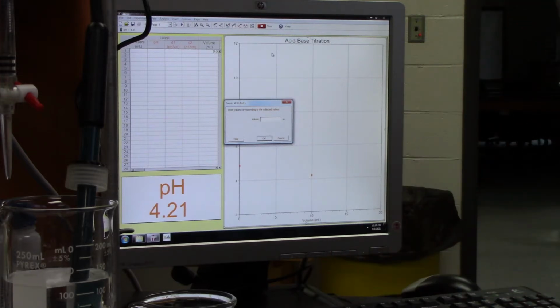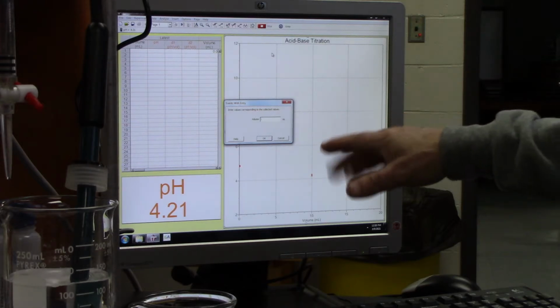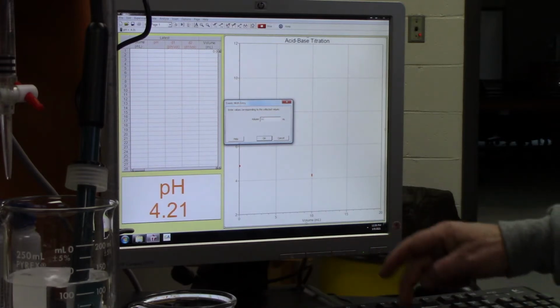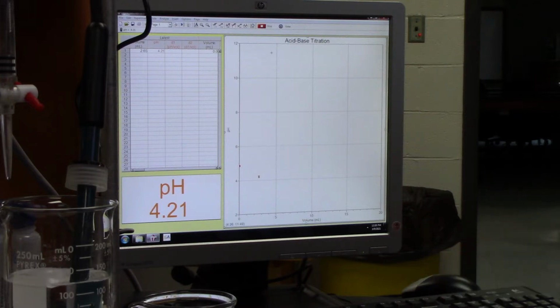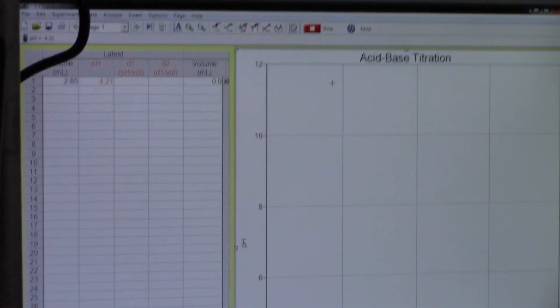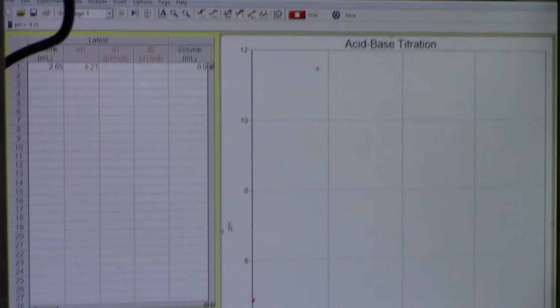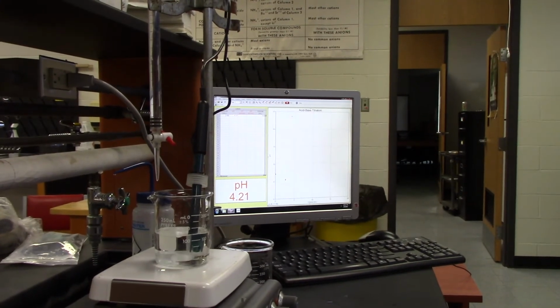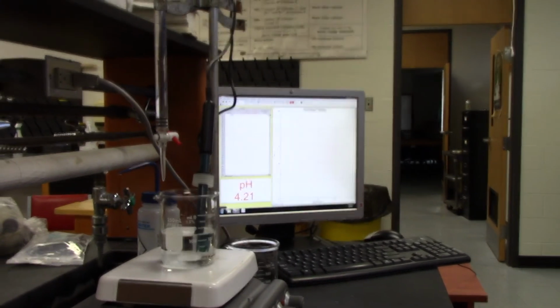Now this is actually 0, but we didn't raise it up to 0. So what we're going to do is every other volume from here, we're going to subtract 2.65 from it. Okay, and if you notice on the table, it's recorded both those values. So let me pull it out so you can see the whole process here, and I'll tell you.